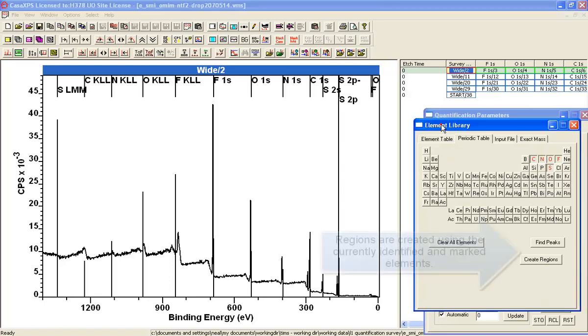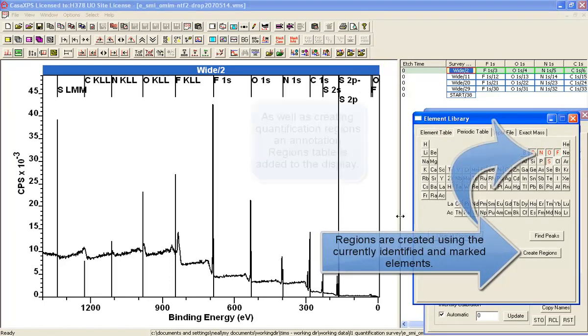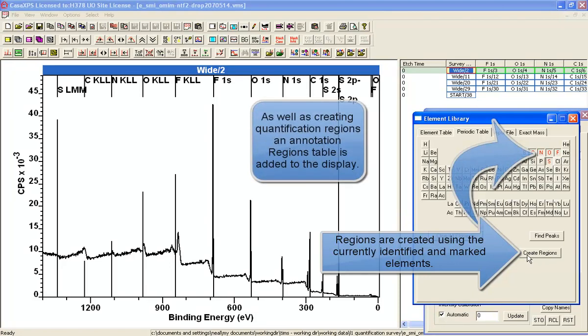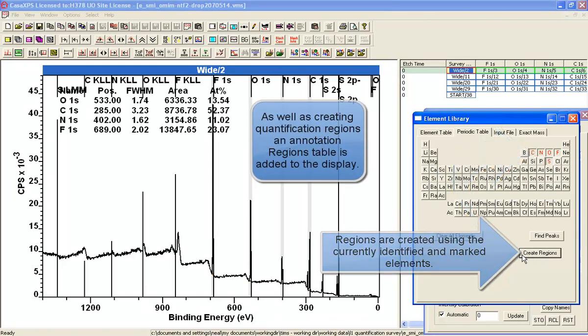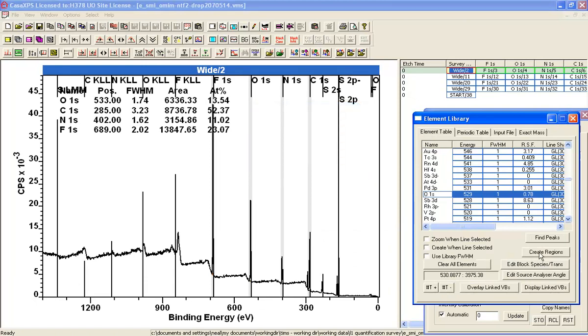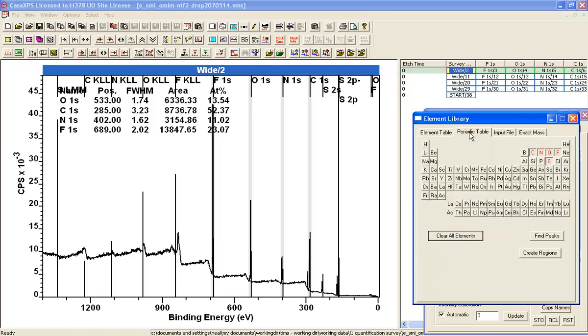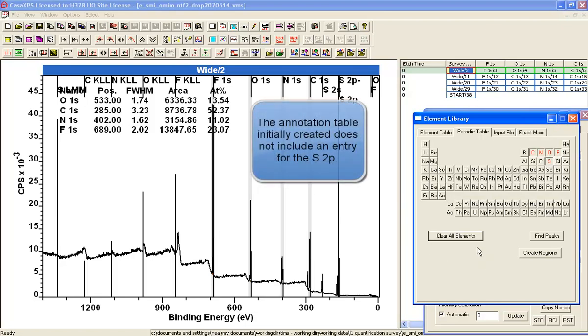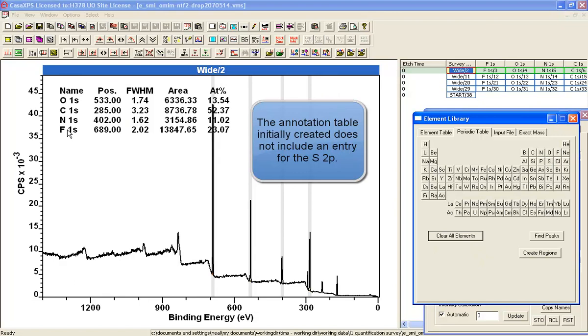So, having identified and decided that these are all good, what we can do is create regions using the button on the periodic table or even the one that's on the element table. They both do the same thing. Based on the buttons you see highlighted here, a set of regions have been created and a table has been placed over the data.